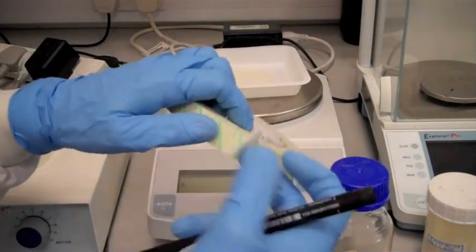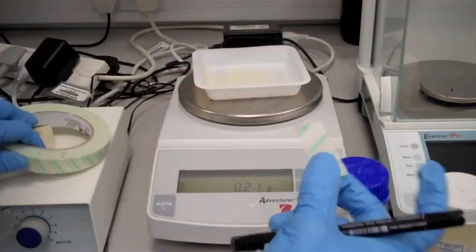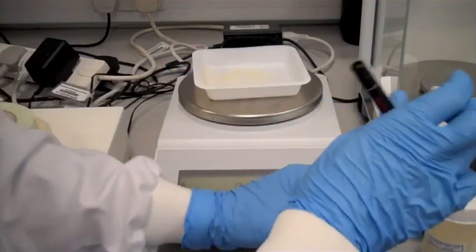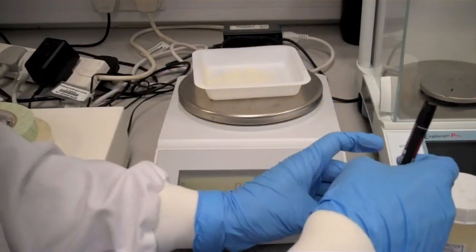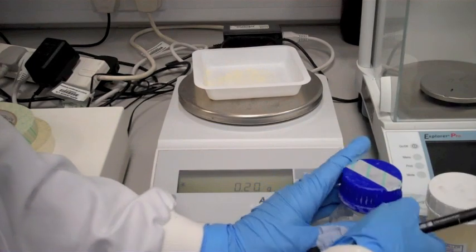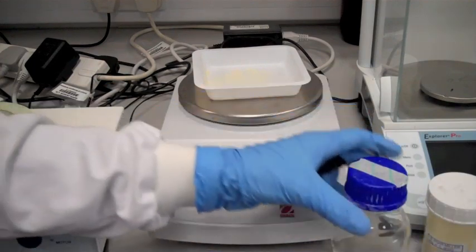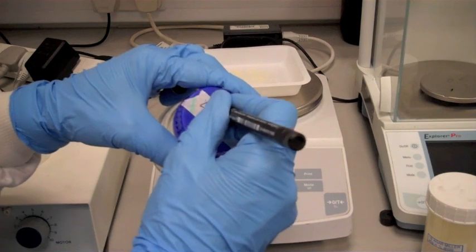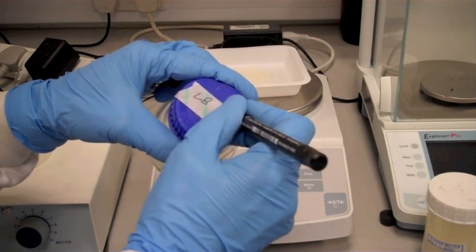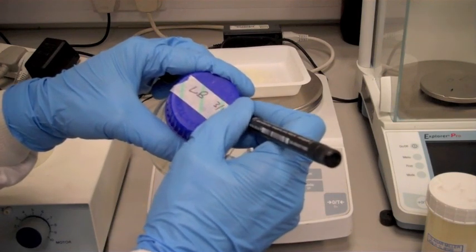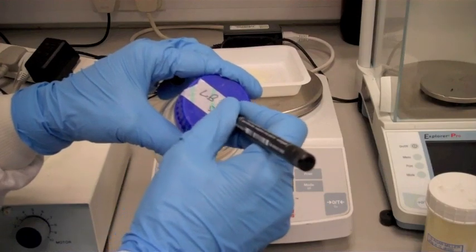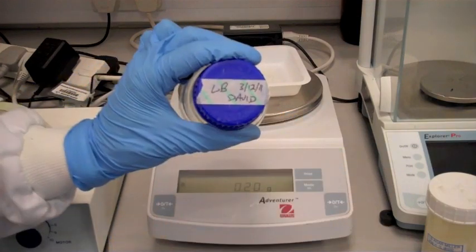So take a little bit of the tape, that's more than enough, and place it onto the lid of the bottle. And then mark on the top LB, the date, and your name. Something like that.